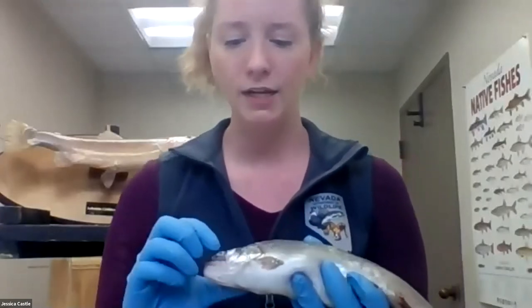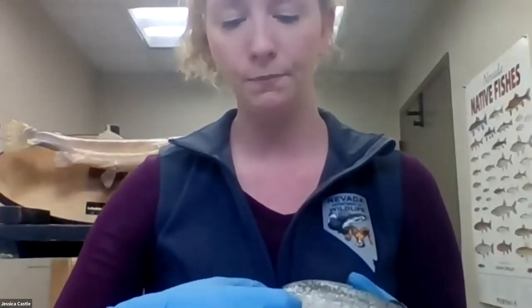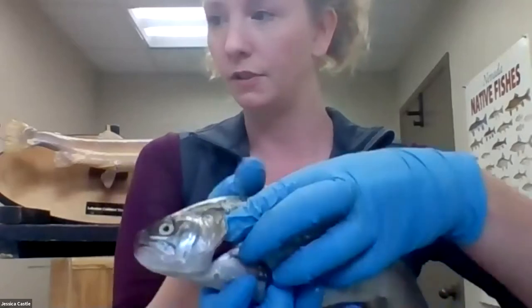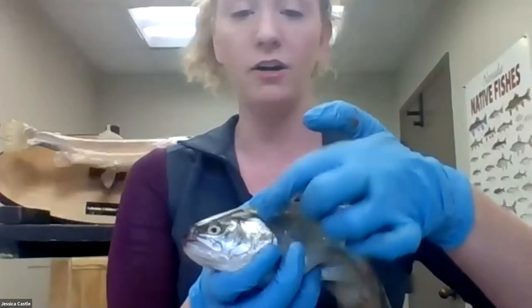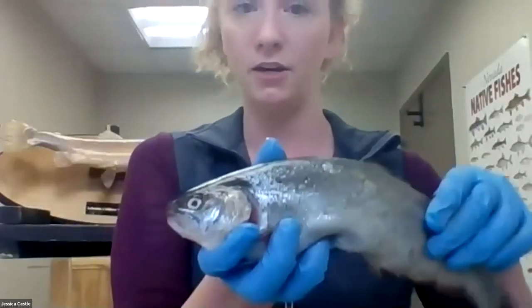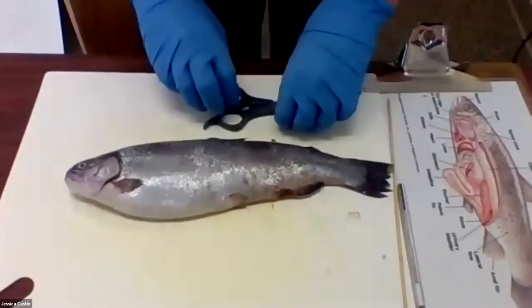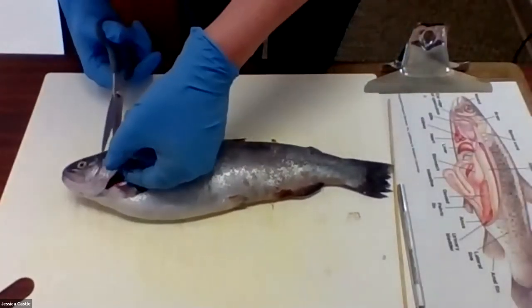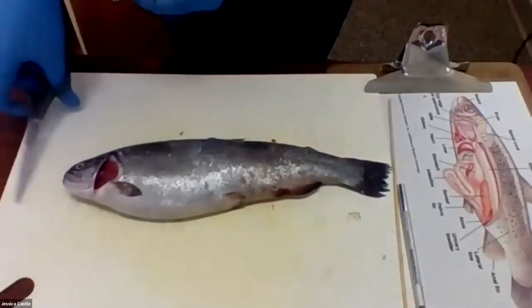Next is the opercula, also called a gill plate. As you might imagine, the gill plate is there to protect the gills which are inside. Compared to the rest of the fish, this is pretty hard — it is a hard outer covering to protect the gills of the trout. I am actually going to cut that off so we can take a better look at the gills.